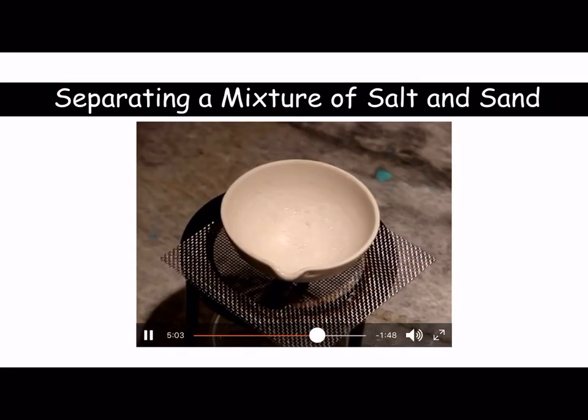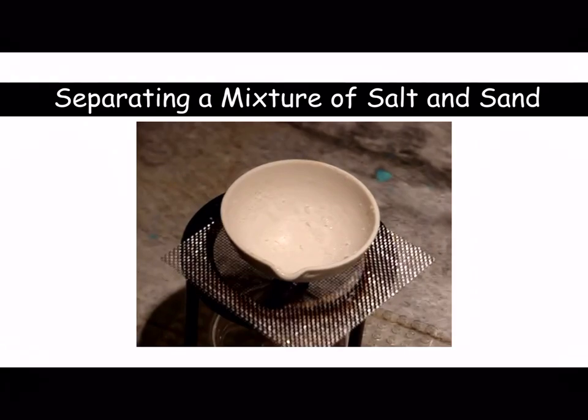So as you can see, the evaporation, and if you look very closely at the sides of the evaporation basin, there are crystals of salt remaining behind. And that's the perfect method for separating a solution of sand and salt.